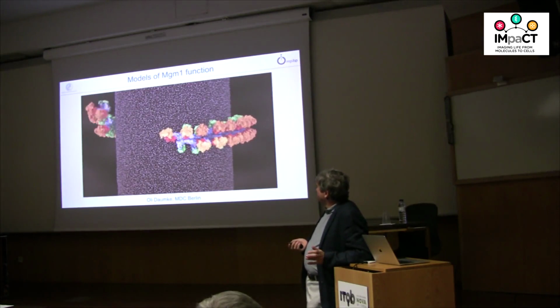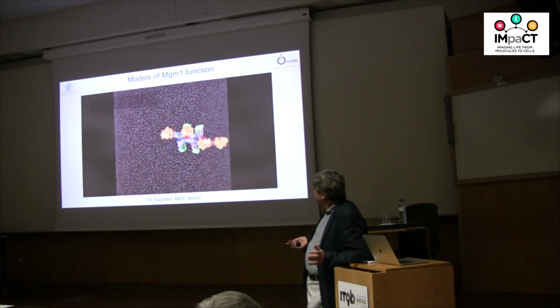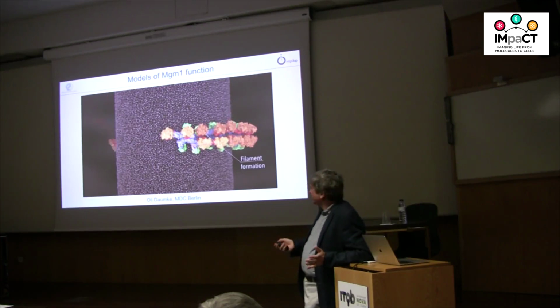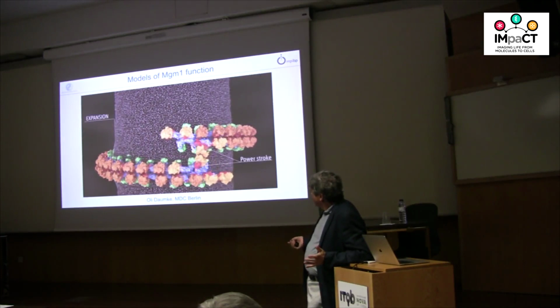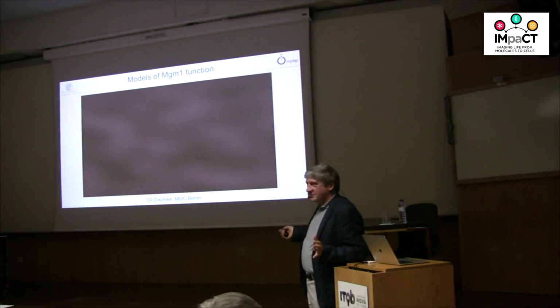And here is expansion that we just showed, started again. Depending on the handedness of the helix, you can either get membrane constriction or expansion. This is, I think, the first one where you get the power stroke here, and then it pulls it apart. It's all a movie.